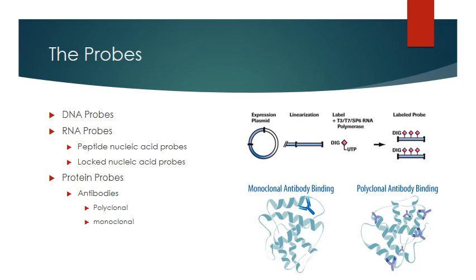RNA probes are obviously going to be made from a DNA template. And because RNA and DNA tend to form a stronger helix than DNA and DNA, the RNA probes generally offer more sensitivity than DNA probes in the Southern blot. So you actually produce the probe in its hybrid form, where you have the RNA and DNA, and then you include a denaturing step in your process to remove the DNA and free the probe, as it were. Okay. But you have to be sure that you have the correct complementary sequence for the target, since you won't have the luxury of two targets like you might have with a DNA probe.